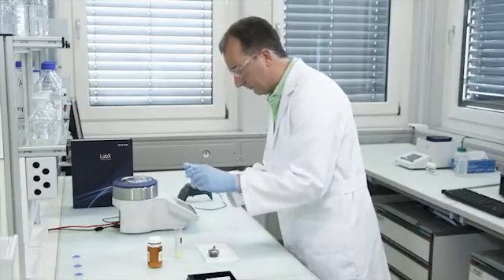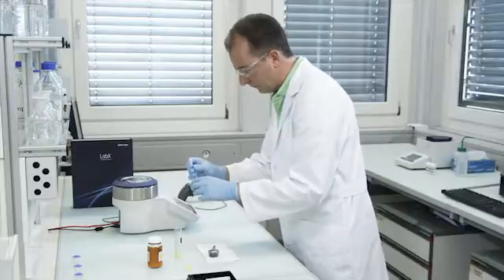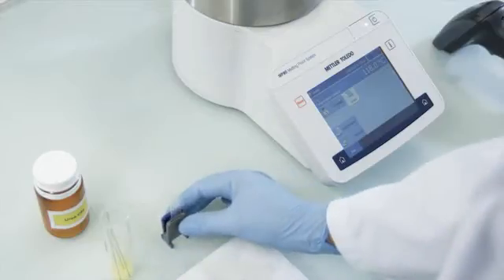Let Paul try the software guided solution. Paul is ready to begin the measurement. The software automatically reminds Paul to carry out a melting point system instrument calibration.